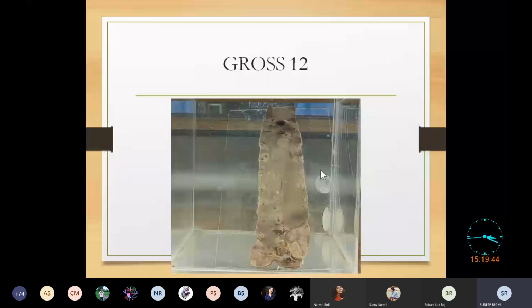So this aorta has been cut and it has been kept there as a flap. It should be a tubular structure, but it has been cut from one side and laid here as a flap. And here are multiple atheromatous plaques. Here also you can see atheromatous plaque.